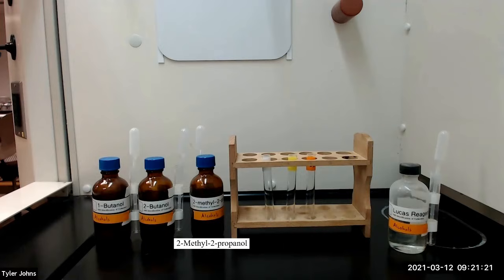This test depends on the appearance of an alkyl chloride as an insoluble second layer when an alcohol is treated with the Lucas reagent, which is a mixture of hydrochloric acid and zinc chloride.